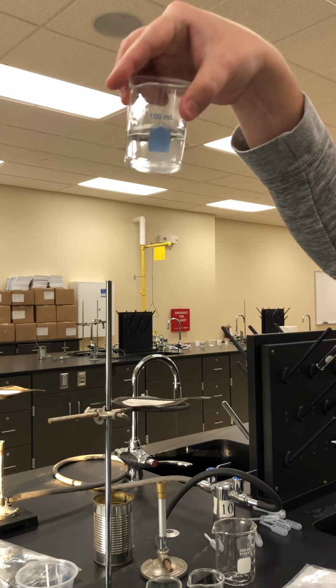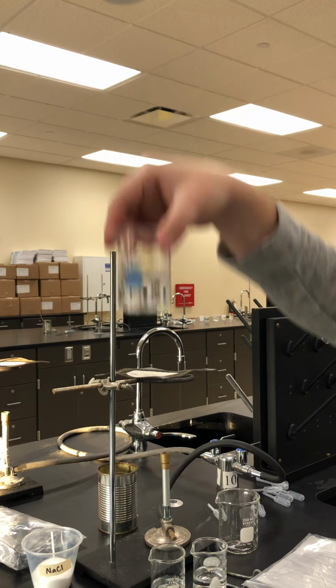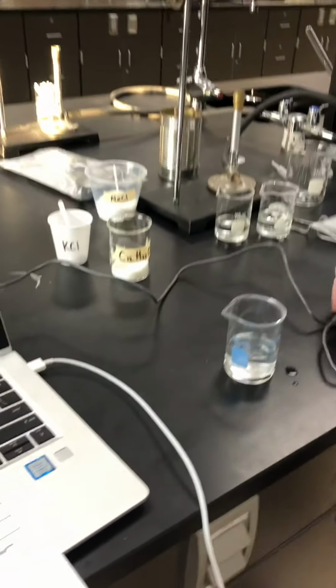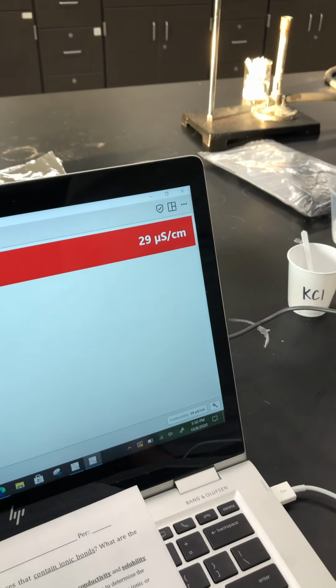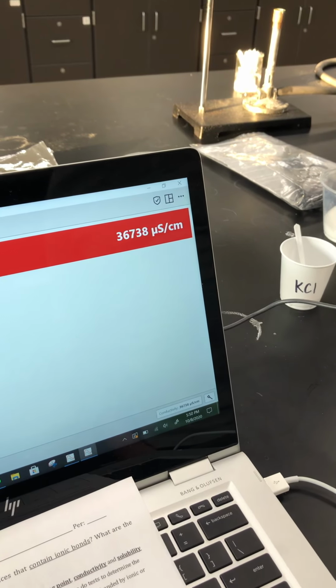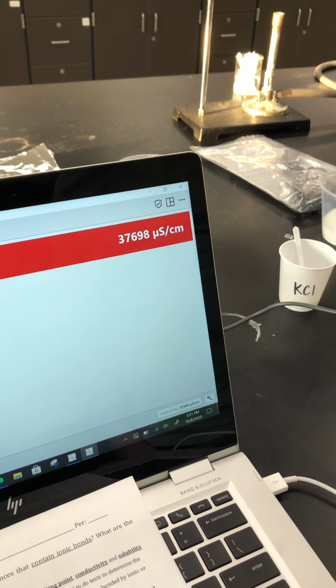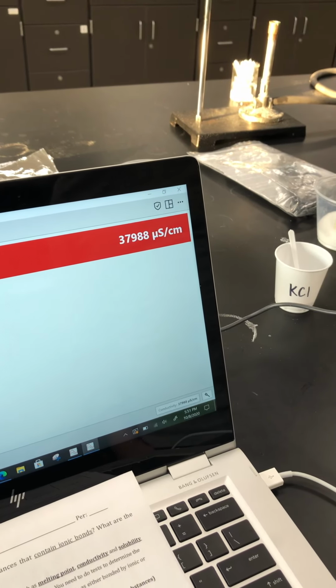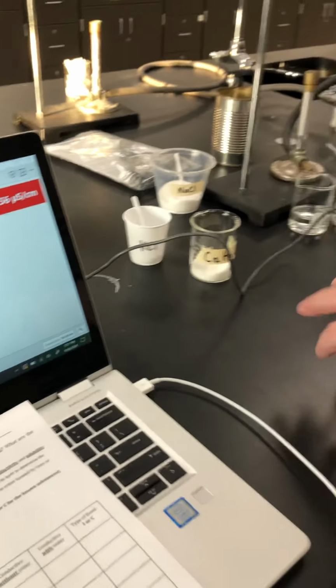And more or less, I don't see very much at the bottom at all. So this one looks like it does dissolve in water. And then we will test for conductivity. So this one's going up into like 37,000 plus. And that was potassium chloride.